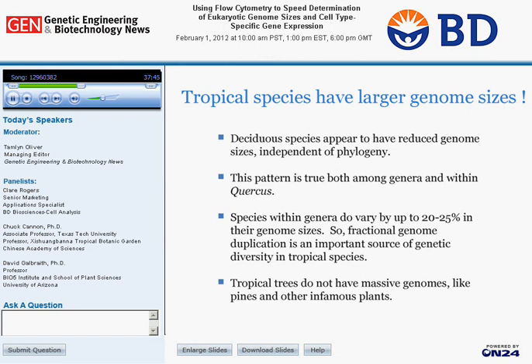And from looking at the previous point, where we have one species that has a 25% larger genome size than others, you can actually begin to choose which species might be interesting to sequence. And so this is providing us a lot of rich information for improving our sampling design and for improving the questions that we're asking. So it's very basic information, but it's actually very critical for improving the research and improving our knowledge. Next slide.